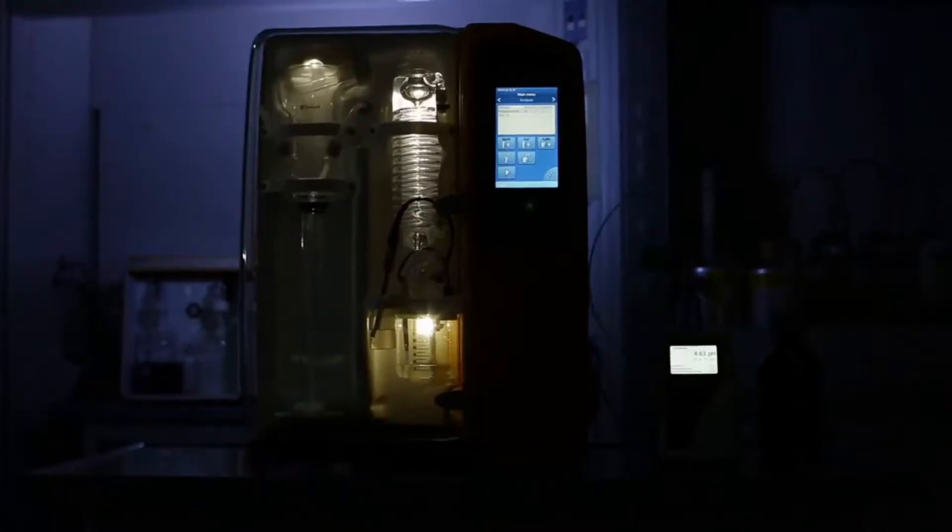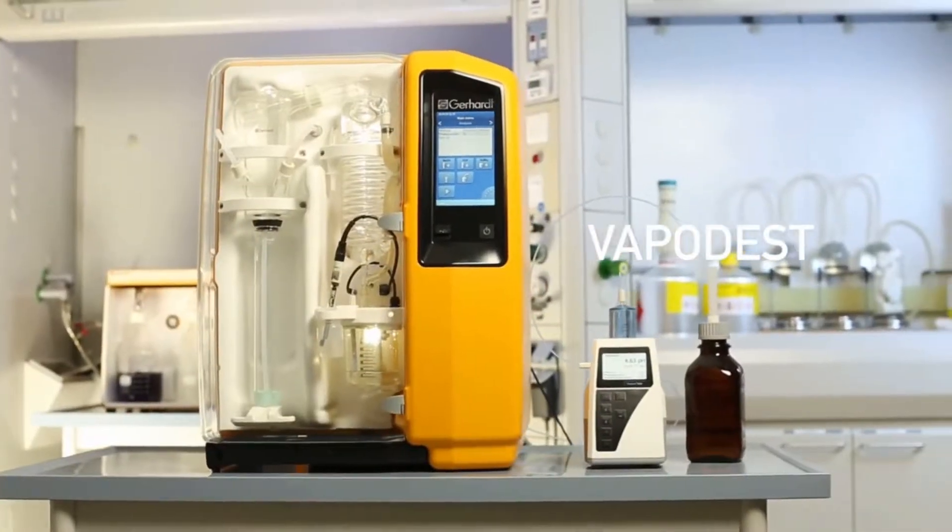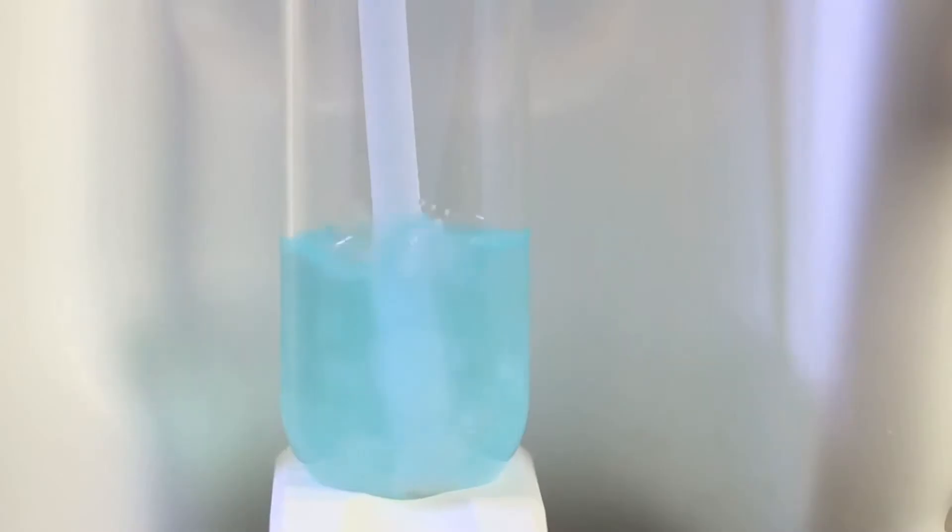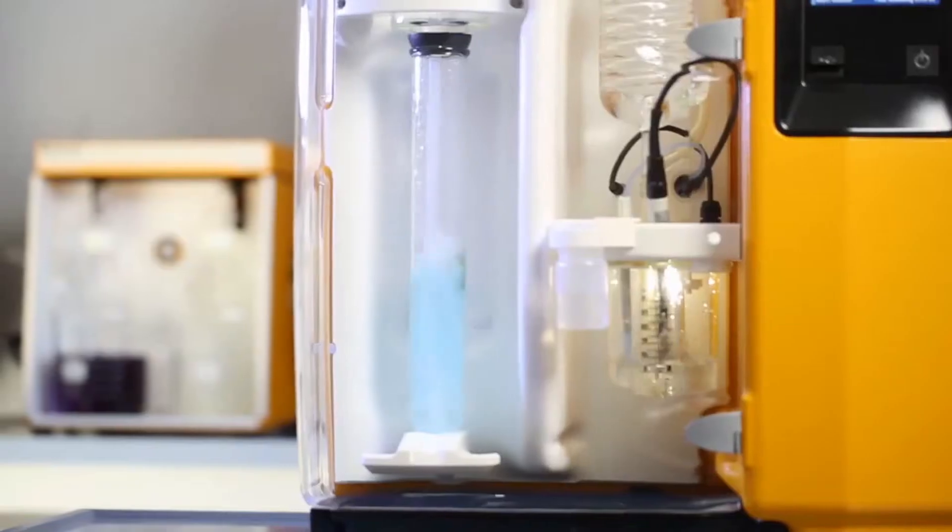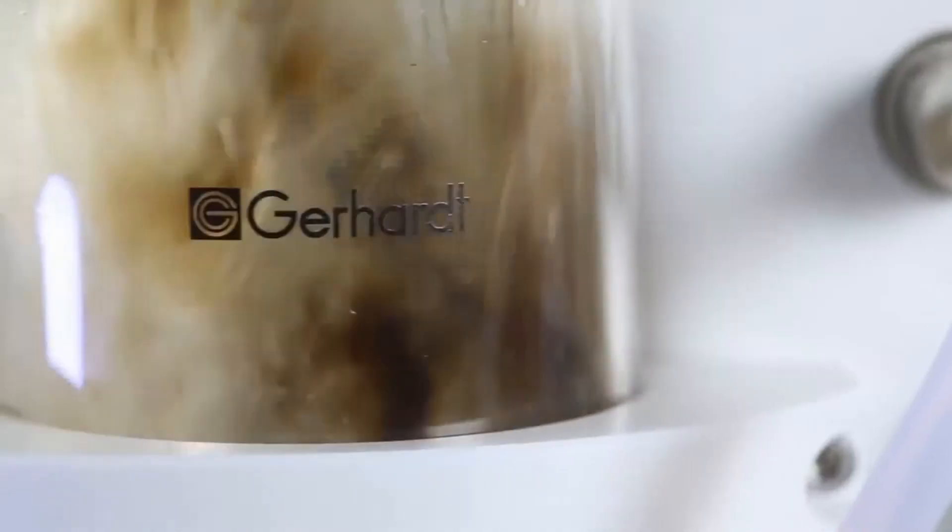Today we're presenting VapoDest, our new steam distillation series. It represents a new milestone in Kjeldahl analysis and is more user-friendly and powerful than ever before.